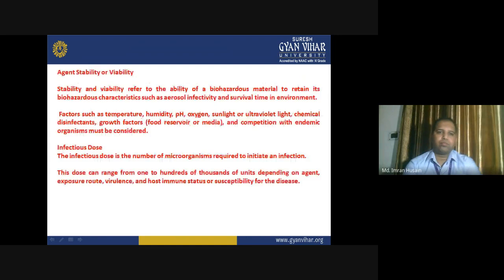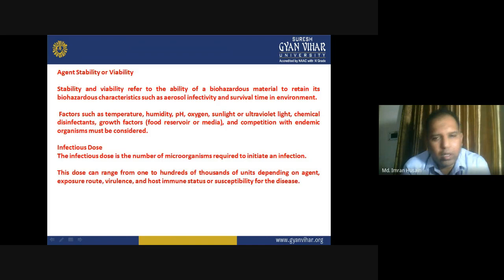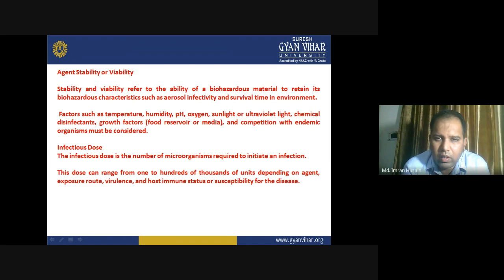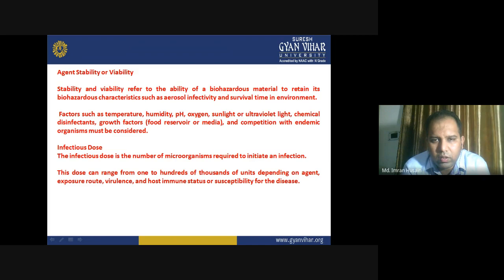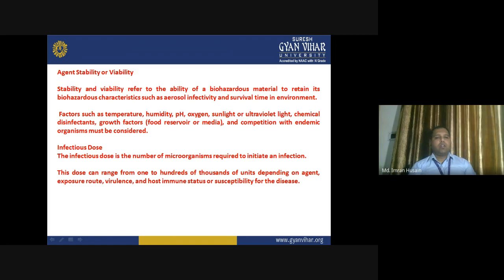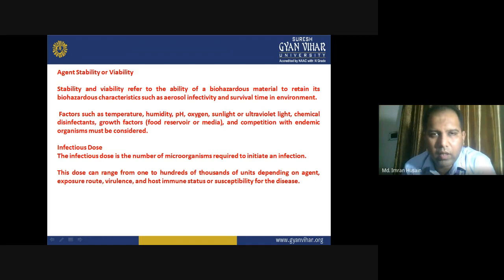Stability or viability: stability and viability refer to the ability of biohazardous material to retain its biohazardous characteristics such as aerosol infectivity and survival time in the environment. Factors such as temperature, humidity, pH, oxygen, sunlight or ultraviolet light, chemical disinfectants, growth factors, food reservoir or energy, and competition with endemic organisms must be considered. Agent stability depends on the atmospheric and environmental conditions in which it is present.